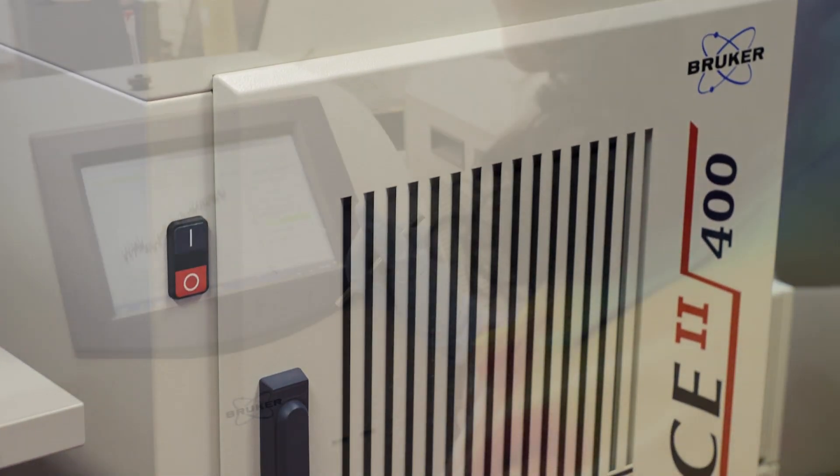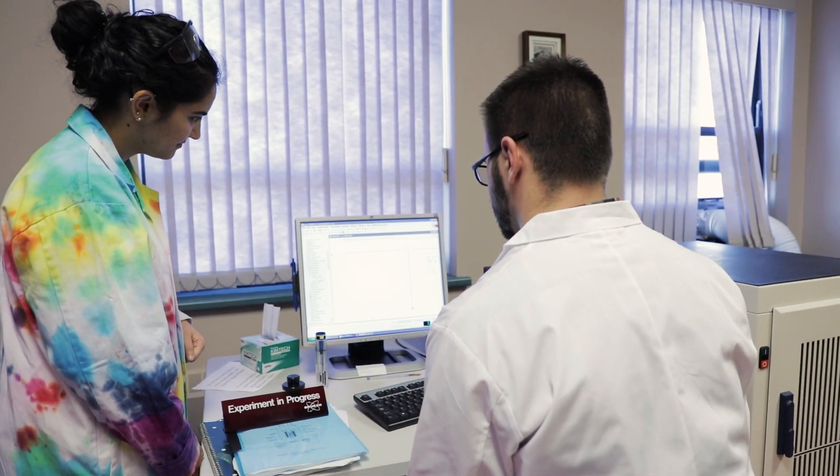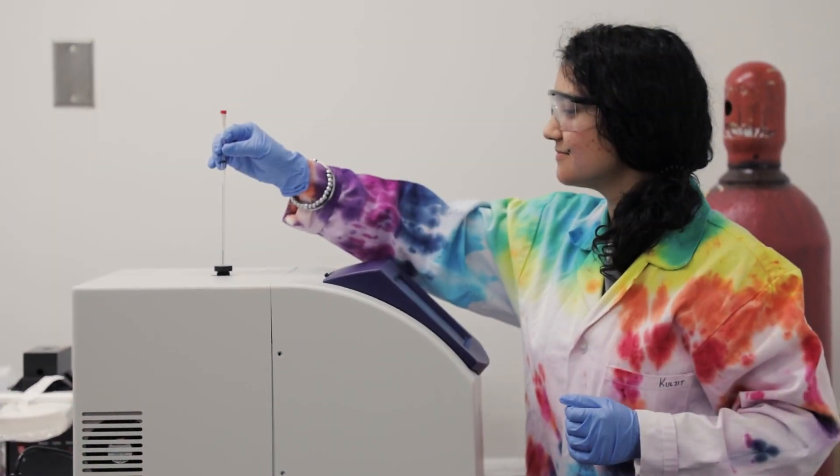So on campus at CBU, we have two instruments that have been supplied by Bruker, an NMR spectrometer and an EPR spectrometer. Both of these instruments are available to our students as part of their undergraduate program. These instruments were chosen for several very important reasons.